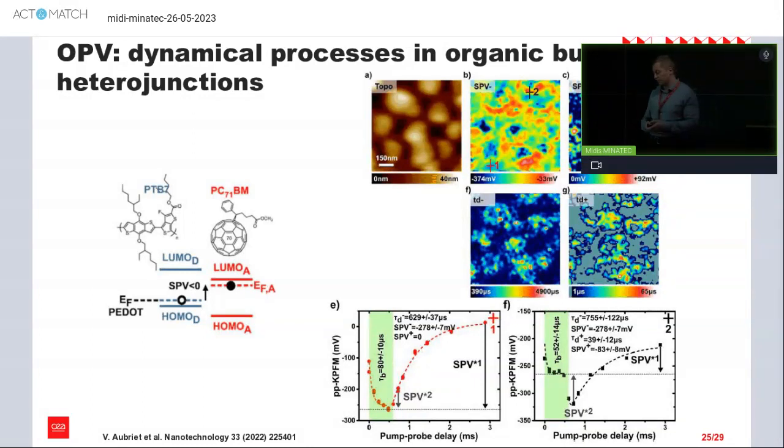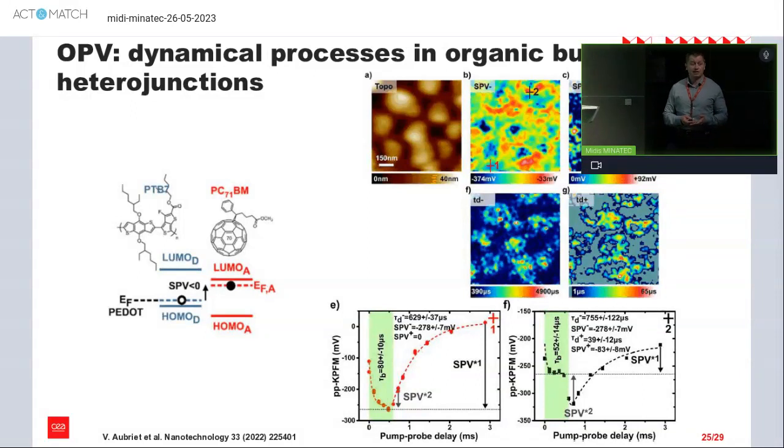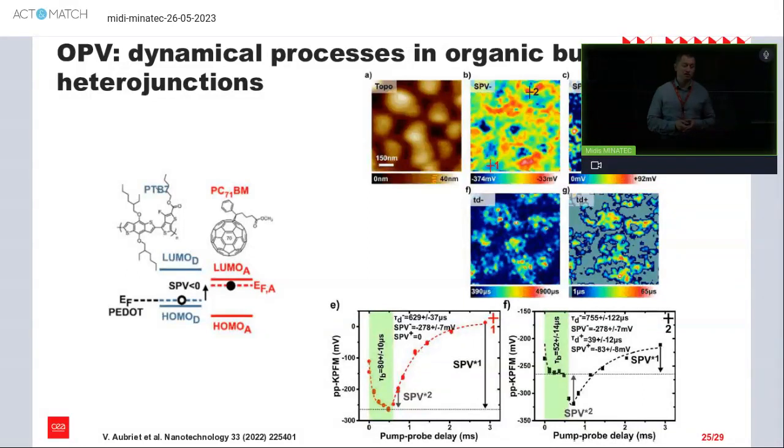You must take this into account. Anyway, if you are doing this kind of measurements, you can directly see this, because you take one image and after another image or larger image, and you can see if your sample surface changes or not. So even if it can be destructive, you can follow the change in your surface.